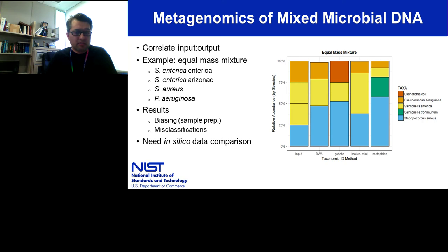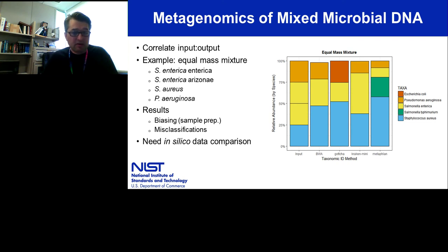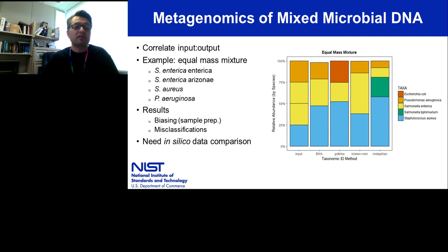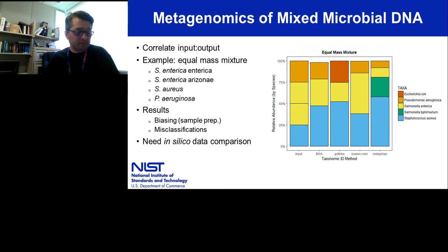Moving to one of the metagenomic mixtures we produced: this was an equi-mass mixture containing two strains of Salmonella, Staph aureus, and Pseudomonas aeruginosa. On the graph, what you see on the left is what we input into the system, and then the results from taxonomic classification using the same dataset from four different tools. What we think we see is that there's certainly bias happening in this analysis, probably due to some sample prep, and there are also some misclassifications. Most of the tools did a pretty good job of identifying the different species and strains present. GOTTCHA seemed to have a little problem identifying the Pseudomonas, and the abundances differ fairly significantly — but this underscores the point that we know biases exist and we're now able to objectively track these differences.